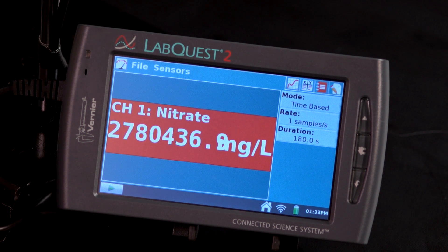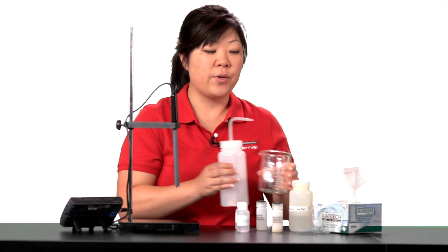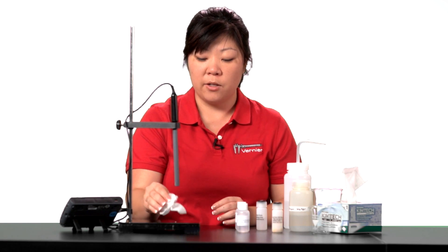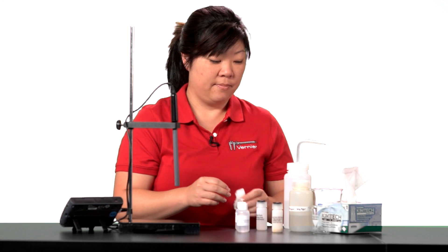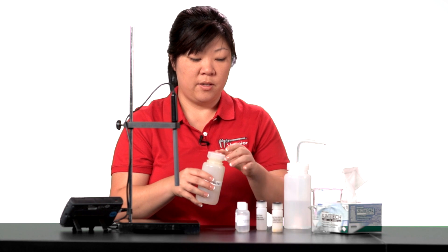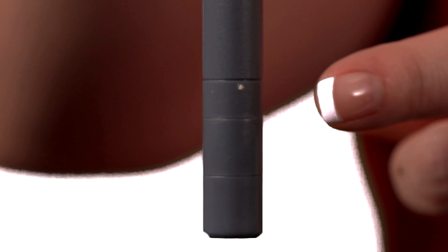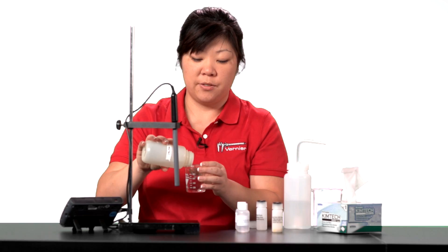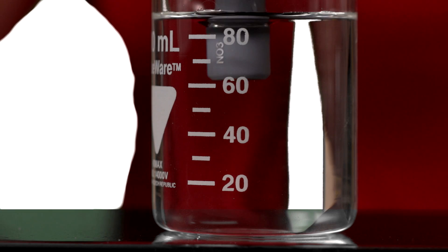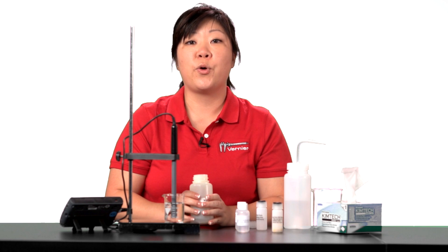You may see some strange readings on the screen. When the sensor is placed in aqueous solutions, the proper reading will appear. Gently blot dry with a paper towel or chem wipe. Here I have a sample of stream water. Again, make sure the tip is not resting at the bottom of the container and your white reference contacts are immersed. Wait 60 seconds before data collection or recording your data.